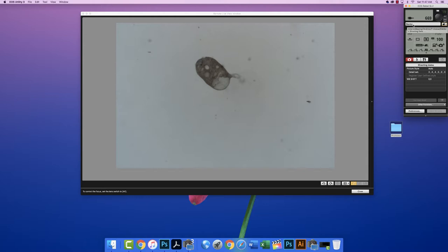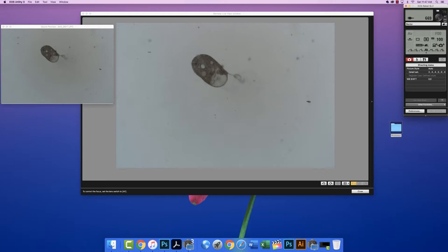So I'm going to take a photograph. This is with the 5X objective. My shutter speed was very low. See? 1/6 of a second. So I'm going to turn up the light so that we have a faster shutter speed. There, 1/25 of a second, and you can see that it's changed the white balance. So I'm going to open the door.